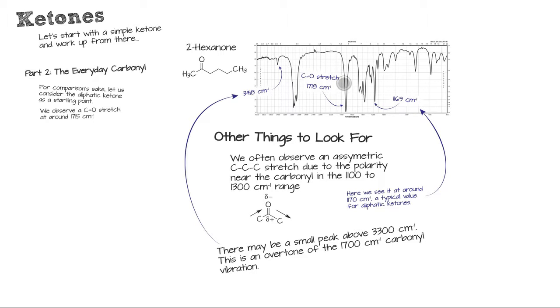Notice that it is not exactly double. That should be 3436, but it's 3418. And that's because, due to the asymmetry of the Morse potential, the vibrational energy levels get a little closer together the higher up we get. So that is a double jump, but it doesn't represent a perfect doubling of energy. So if you see peaks in unexpected places, look for a really large peak at about half that frequency, and sometimes that would explain it for you.